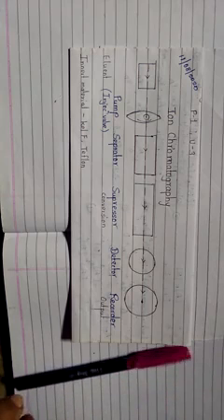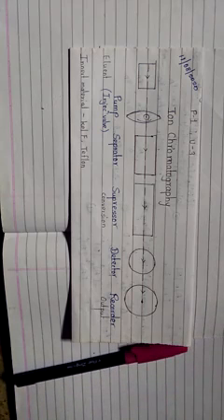Next one is the separator column, which contains the ion exchange resin. It is specially manufactured for the ion chromatographic technique. In short, in the separator column, separation takes place. After that, the solution is passed to the suppressor.